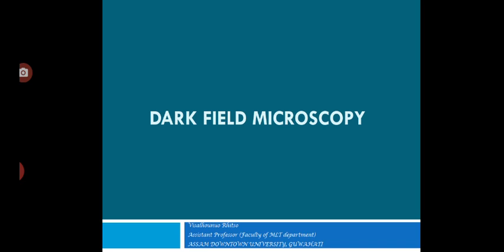The design of the dark field microscope is such that it removes the dispersed light so that only the scattered beam hits the sample. The introduction of a condenser and or stop below the stage ensures that these light rays will hit the specimen at different angles rather than as a direct light source above or below the object. The result is a cone of light where rays are diffracted, reflected and or refracted off the object, ultimately allowing the individual to view a specimen in a dark field.